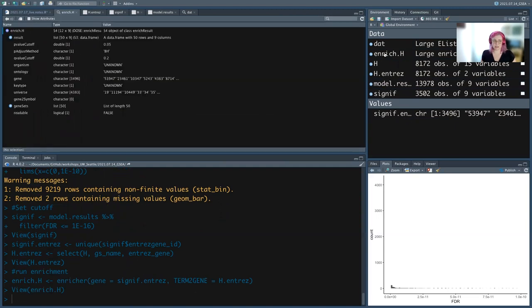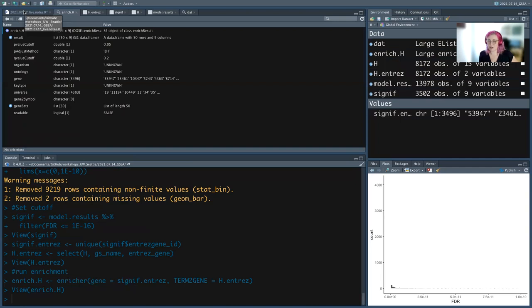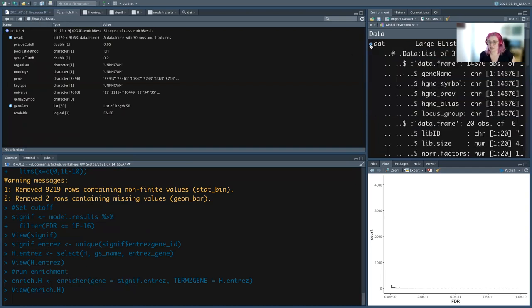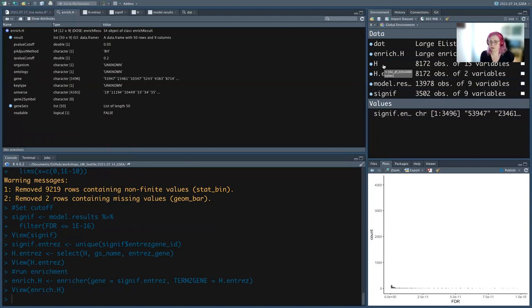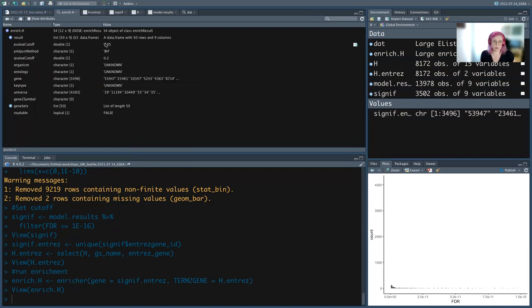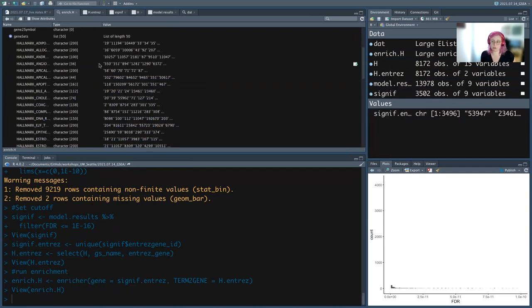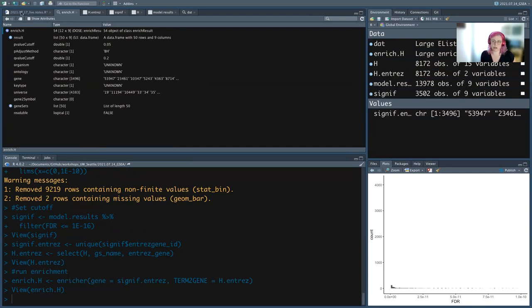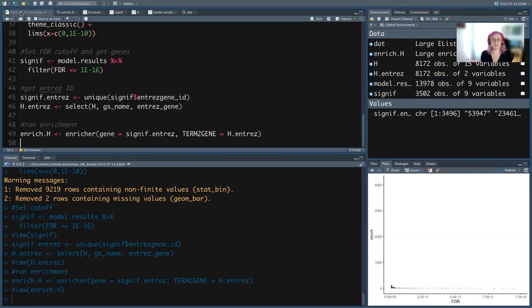This is an S4 object, which works very similarly to S3 — it's a way to put a lot of things together. There's a data frame in here with your actual results, and it also stores parameters for how it was run plus all the gene lists you input. To get the data out, instead of the dollar sign we use an at symbol — this type of data uses '@' instead of '$'. All the data we care about are in 'result'.